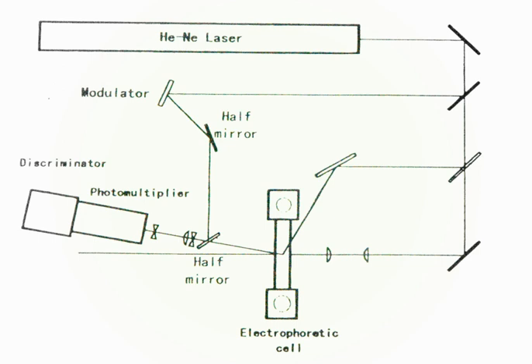Topic: Applications. Electrophoretic light scattering (ELS) is primarily used for characterizing the surface charges of colloidal particles like macromolecules or synthetic polymers (for example, polystyrene) in liquid media in an electric field. In addition to information about surface charges, ELS can also measure the particle size of proteins and determine the zeta potential distribution.